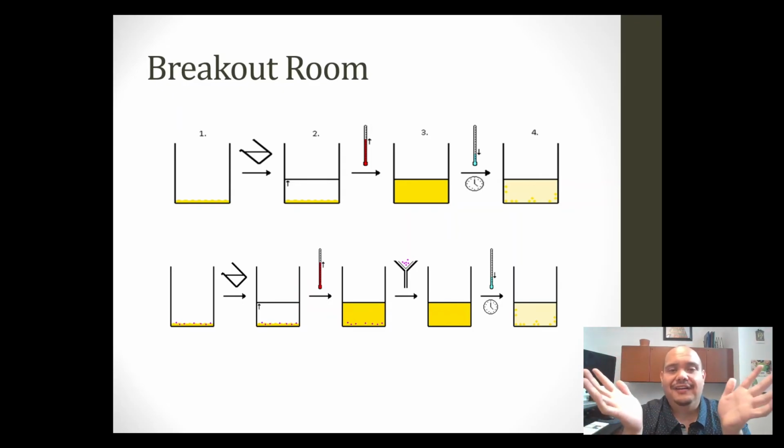So all in all, if you were able to figure out the solvents and the temperatures, both high and low, remember, step 2 shows a high temperature. Step 3 is the cooling process, which is why it shows a low temperature. That's the most important part of what I wanted you to gather from this diagram. If you were able to get at least that much, you are on the right track.